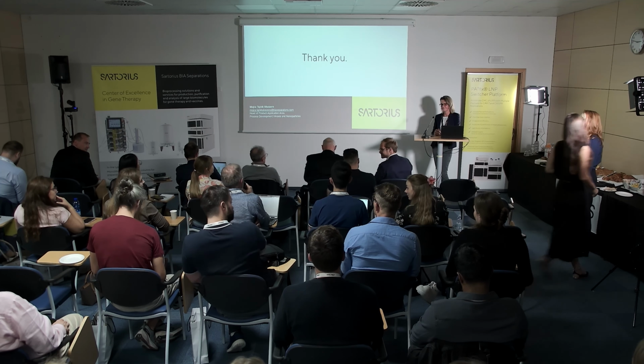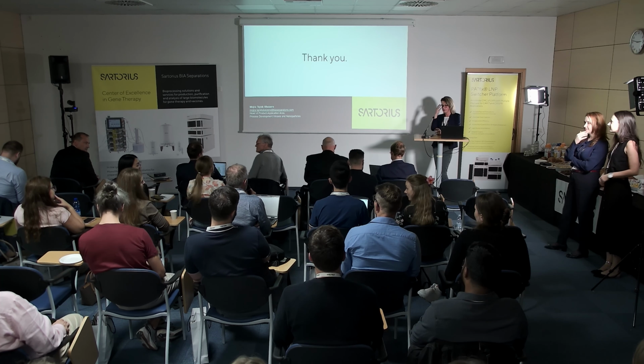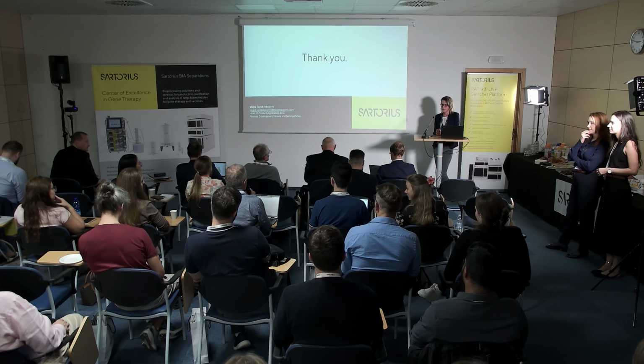Thanks a lot. On top of the things that you showed with in vitro expression, we have worked a bit in parallel with the same column, and we did purification for animal experiments, also with luciferase. Essentially, we saw no difference between the purification methods. So it seems like there are also no adverse effects for the expression and the safety in mice, at least. Great, nice. Thank you for sharing these insights.